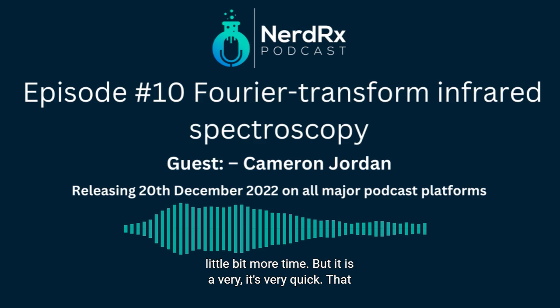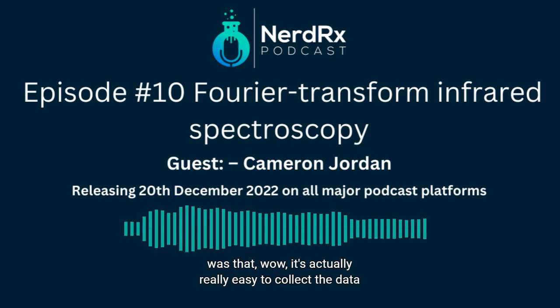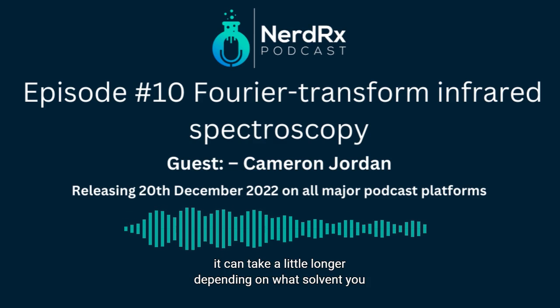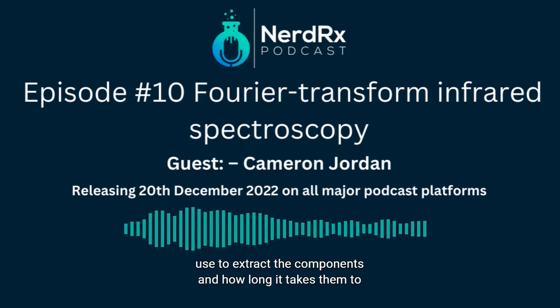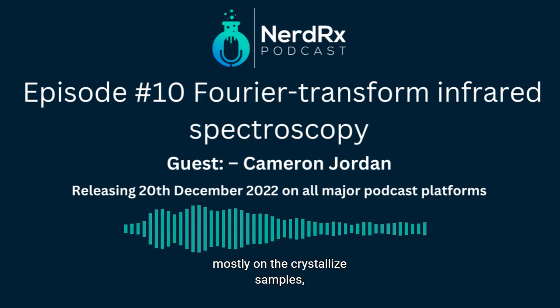But it's very quick. That was one thing that I picked up on when I first started working: wow, it's actually really easy to collect the data for this. Right. But in the case of mid infrared, for example, it can take a little longer depending on what solvent you use to extract the components and how long it takes them to evaporate. Because a lot of the times, mid infrared is used mostly on crystallized samples.